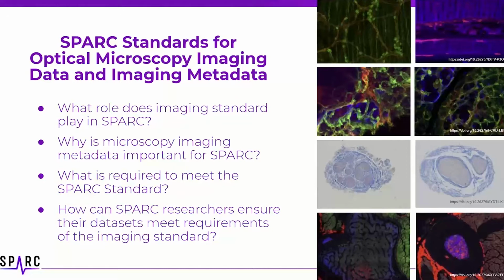However, when image data is converted to another form, such as converting the Zeiss standard CZI format to the open format such as TIFF, often nearly all essential metadata is lost from the file. When this occurs as part of the experimental analysis pipeline, a final step to reincorporate the metadata is required. If this information is not part of the minimum information available, then the file is ultimately of limited value.